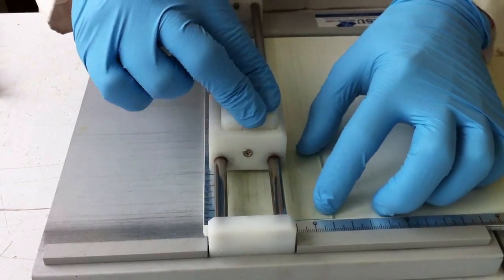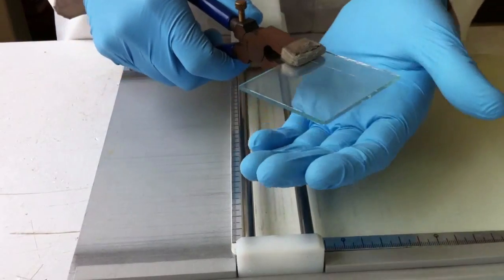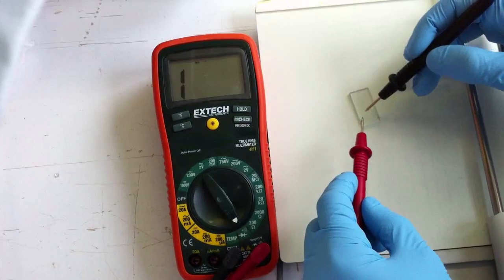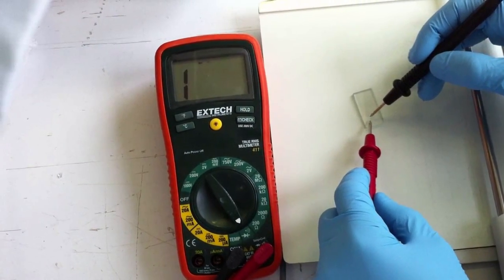The first step in our cell assembly is to cut the optically transparent electrode to the appropriate size. Next, we test our electrode for conductivity.